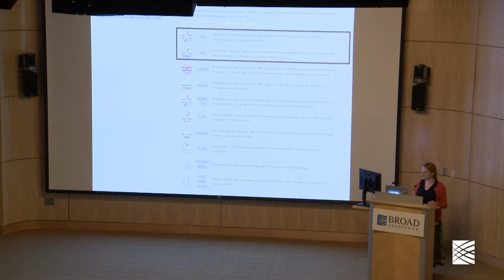But for the sake of right now, I'm just going to focus on if you're looking to do targeted genome editing, and so you're looking to cause a double-strand break and cut the DNA.